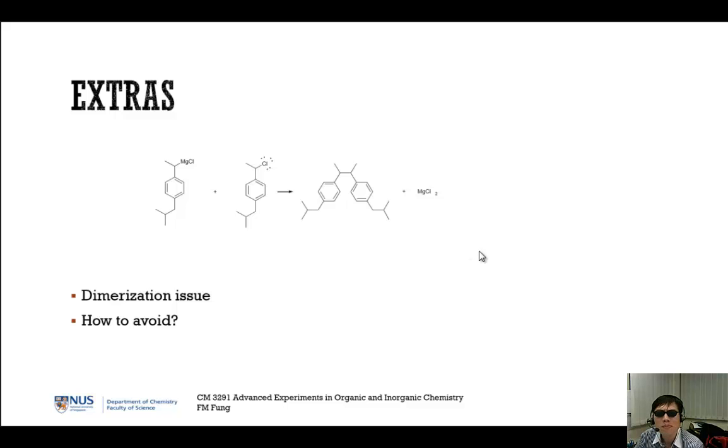How come? It's possible because the sodium salt of ibuprofen is soluble in water, but not ether, whereas the dimer is soluble in ether, but not in water. You can see easily because the dimer is very hydrophobic. There isn't any interaction with water, ion dipole, or even Coulombic attractions. No. So that's why we use THF.